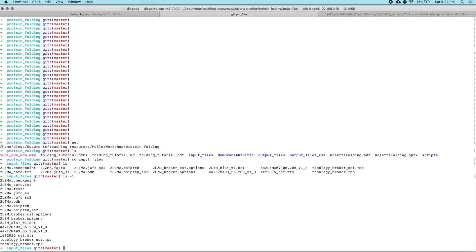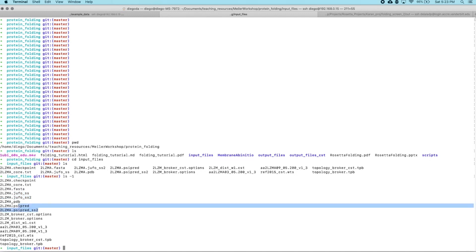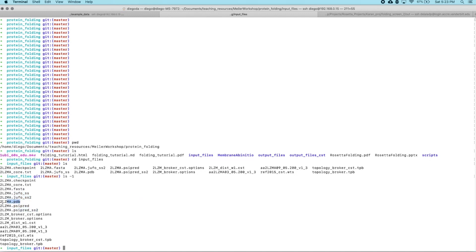The tutorial gives instructions on how to obtain everything you need to fold T4 lysozyme, but we have all the files here. I'm not going to go through that part of the tutorial. Essentially what you want before you start anything else is your FASTA file, and from your FASTA file you can obtain your secondary structure prediction, which are these two files plus these two files. We also have our native file here, which we'll be using for the purposes of comparison. We have a file over here that is just going to describe what the secondary structural residues are, and that's what we're going to use to calculate the RMSD.